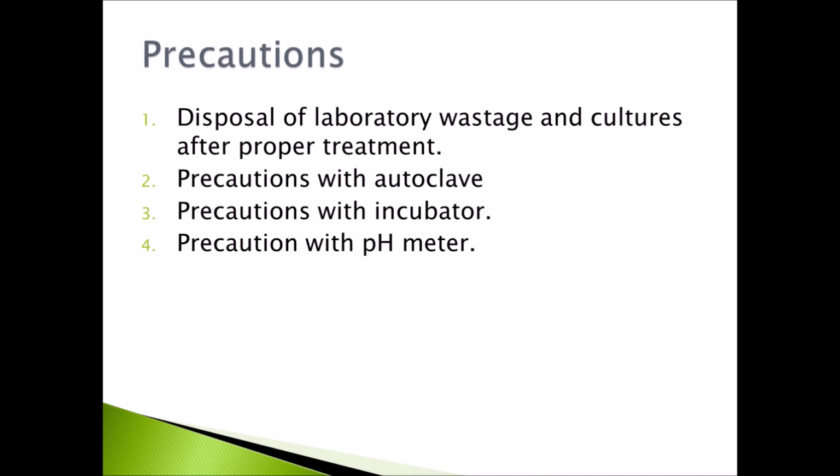If the petri dishes are to be incubated for a long time, they should be placed in a moist chamber with a damp sterile cotton wool at the bottom.